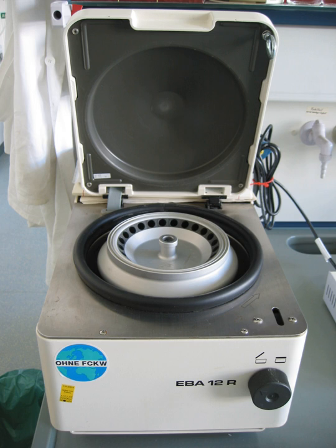A laboratory centrifuge is a piece of laboratory equipment, driven by a motor, which spins liquid samples at high speed. There are various types of centrifuges, depending on the size and the sample capacity. Like all other centrifuges, laboratory centrifuges work by the sedimentation principle, where the centripetal acceleration is used to separate substances of greater and lesser density.